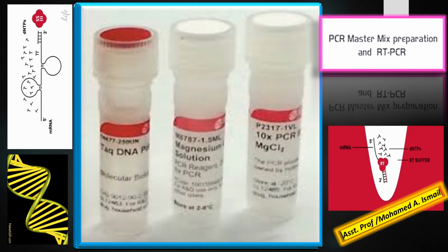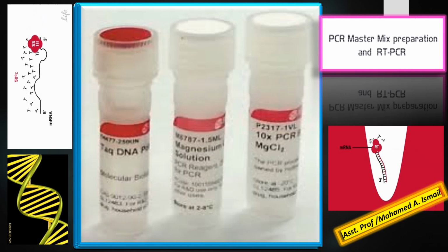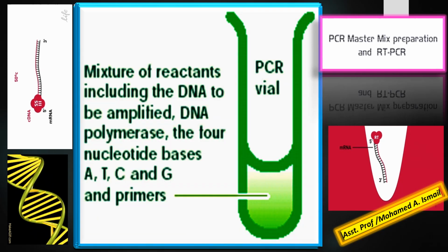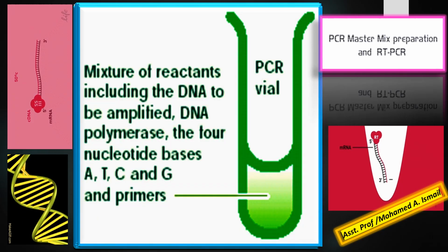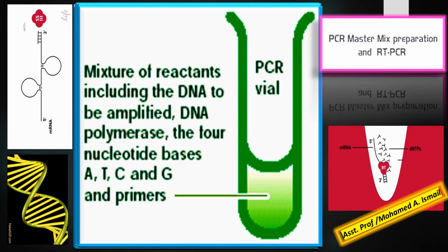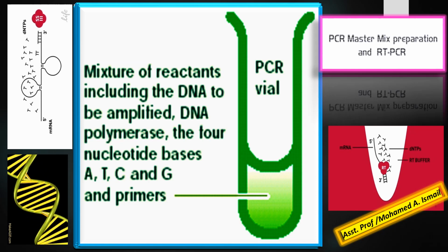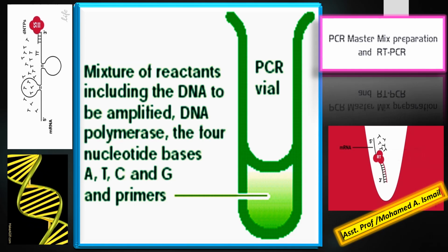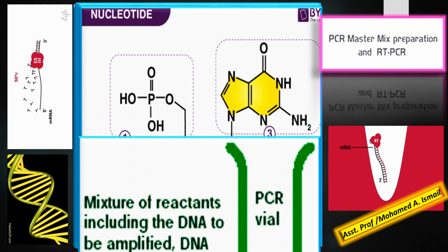Please note that in some cases it is included in the polymerase buffer, whereas the deoxynucleotides A, C, G, T are incorporated into the newly synthesized strand by Taq polymerase.